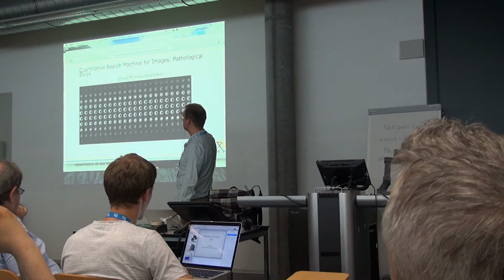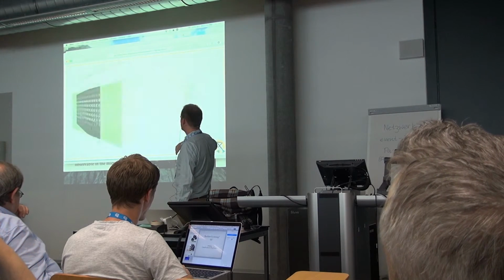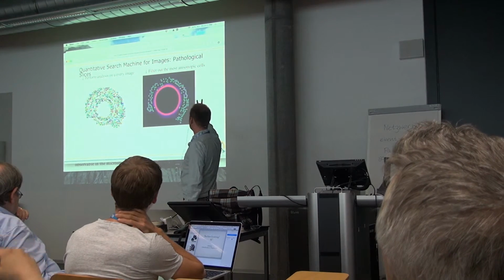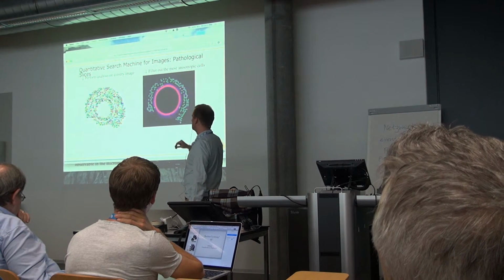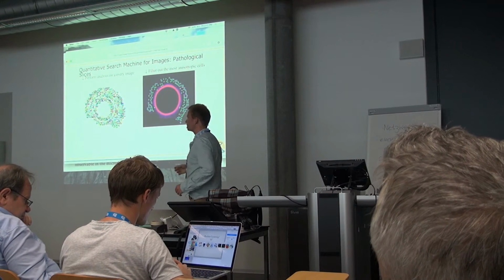And so what happens there is, of course, it loads in the background all the myeloma data from patients, performs the analysis on every image, and then filters out the anisotropic cells that you're interested in. So you have your final result. And it doesn't matter if there's a terabyte of data or 100 images, it scales and distributes it using whatever resources are available.